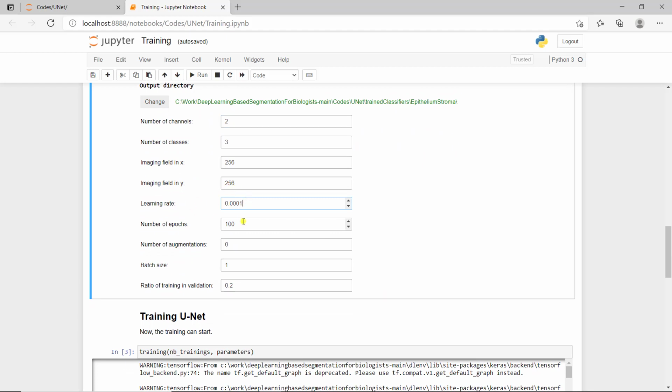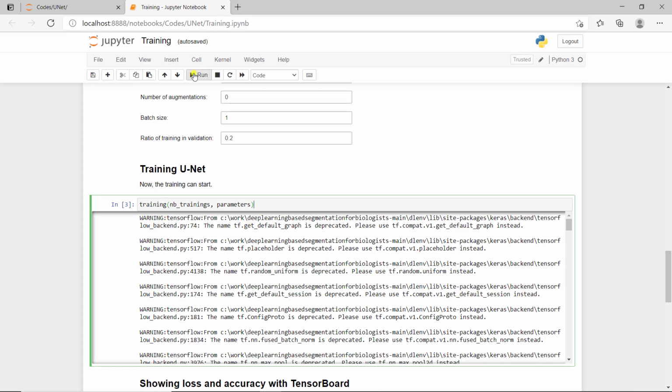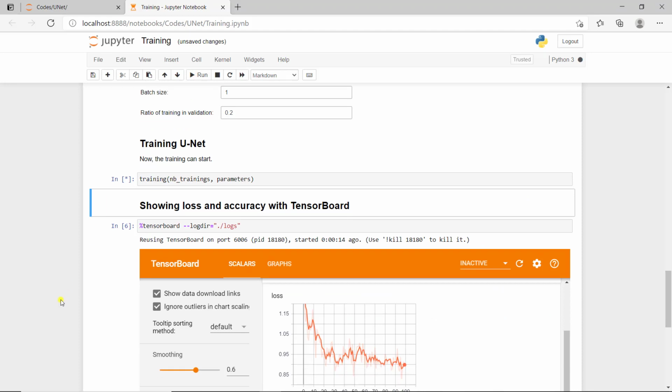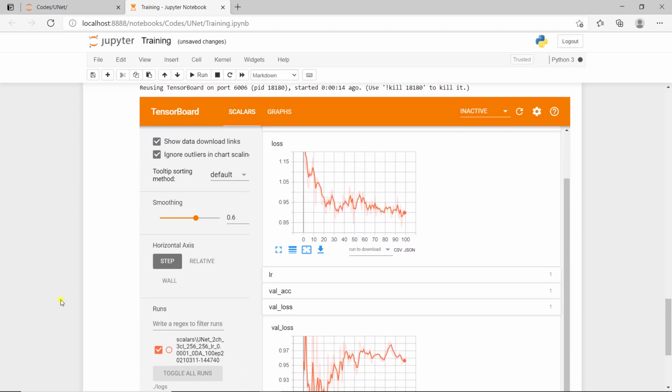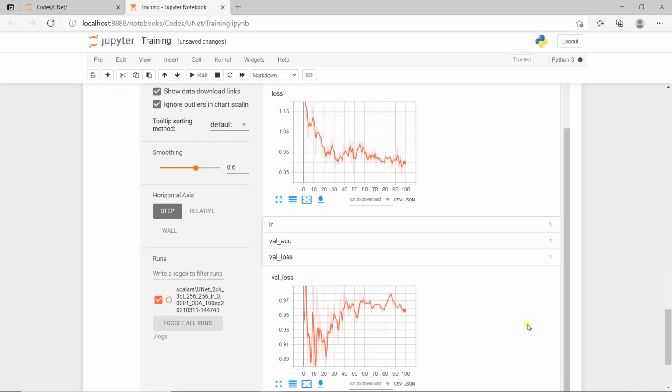This is the value I took for the first training, so I'm going to take something that is 100 times less. So now we have 0.01, the one we did before, 1e minus 4, and this one 1e minus 6. So I'm going to train all of this, all right. And all right, it started. And now I'm going to speed up the video so you don't have to wait for it, but we should see the curves that are defined over the training.